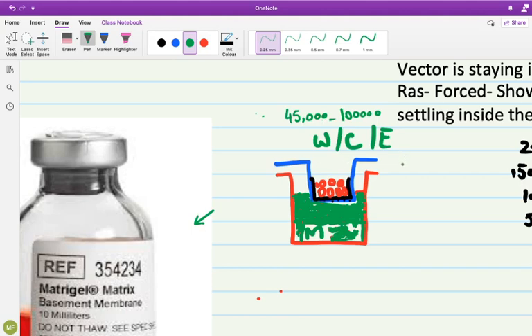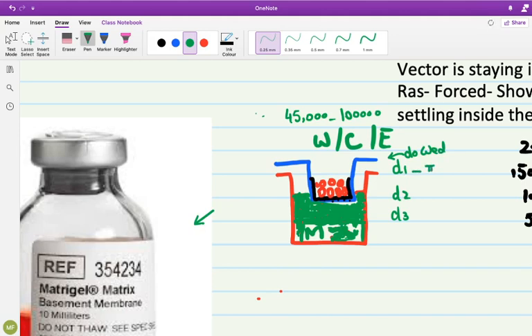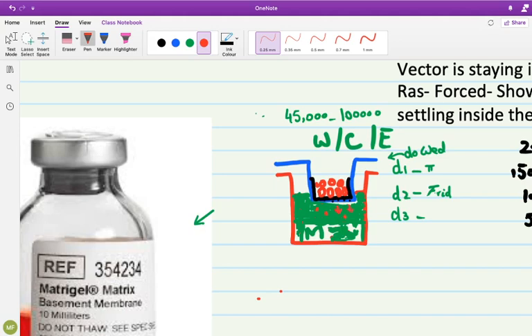We settle them as day 1, day 2 and day 3. On day 1 we set up this experiment and then we call it as day 0. So if it is Wednesday today we assume this is day 0, next is Thursday nothing to do, Friday nothing to worry about but on Saturday we are going to see how many cells travel and come over here. The cells which are crossing these pores, these black holes will be ideally settling over here, maybe on the top of each other, maybe on the membrane. Once they cross this matrigel they are settling inside the well. Then we count the number of cells present in this region.